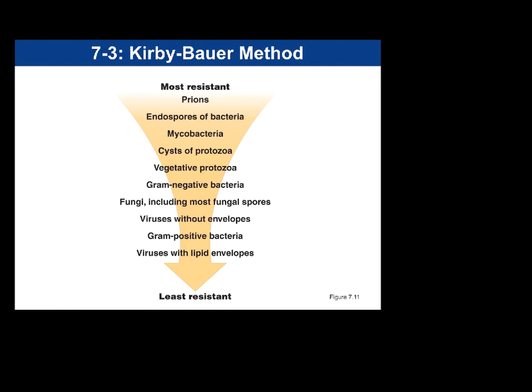majorly scary infection. In order to destroy prions, you have to treat that particular equipment with proteases, which are going to be enzymes that digest proteins, as well as expose the particular, again, materials, supplies, to a higher autoclave temperature for a longer period of time.